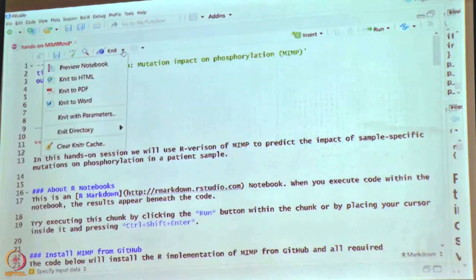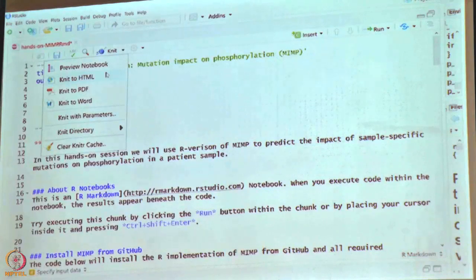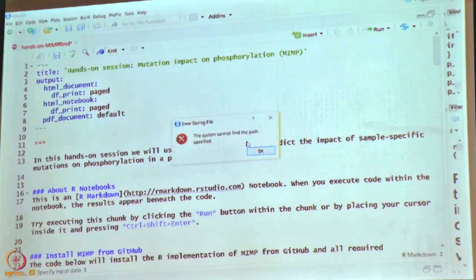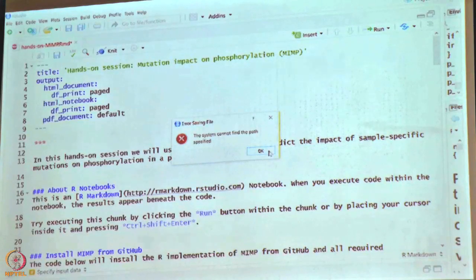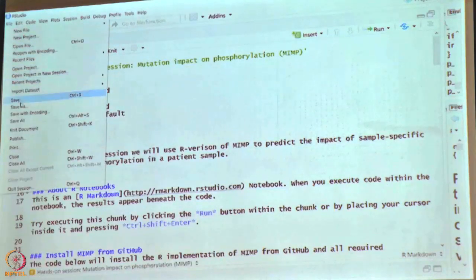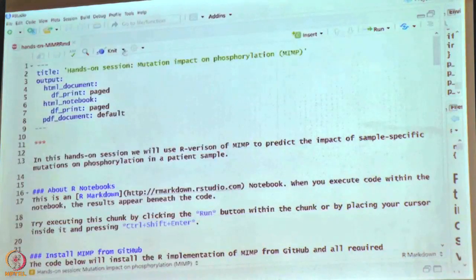Once installation succeeds, we will try to render this R Markdown document into an HTML report and then look at it, since it is easier to read.